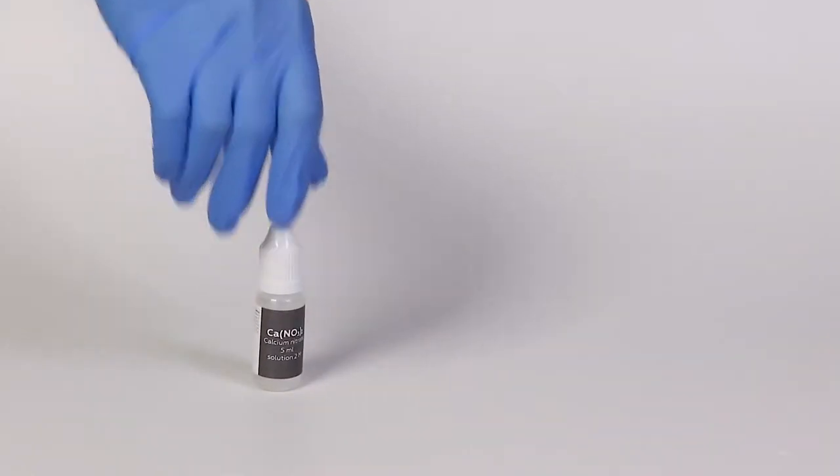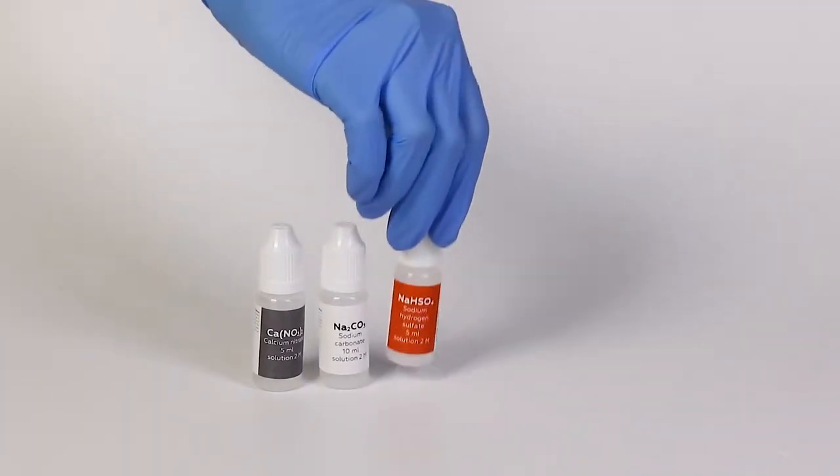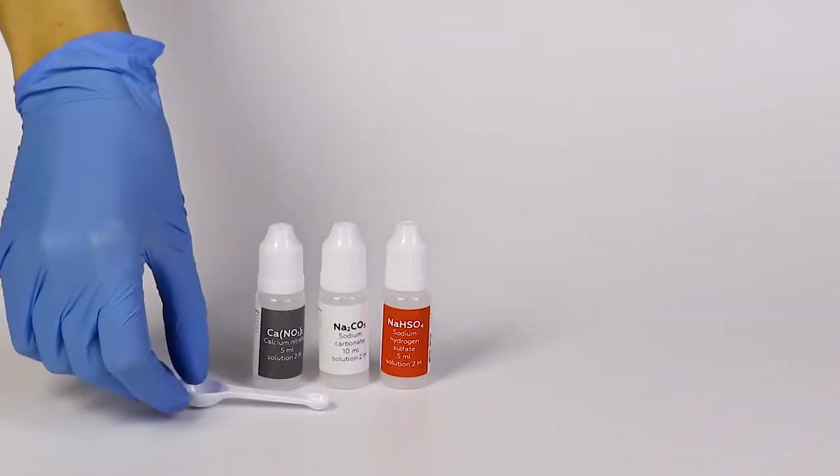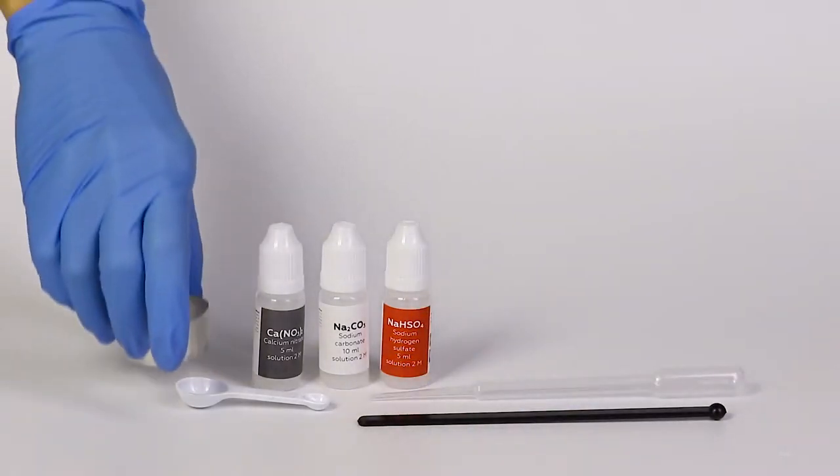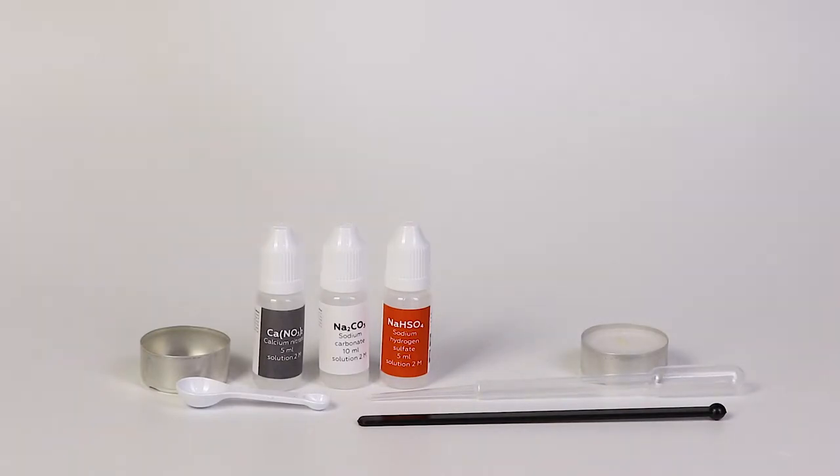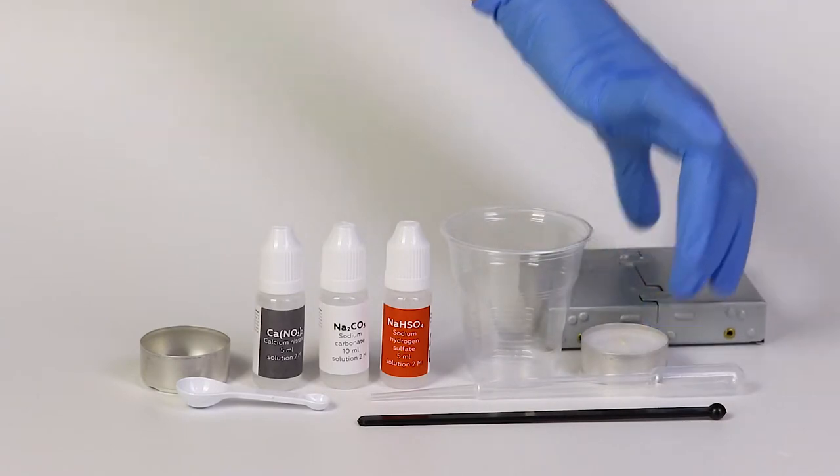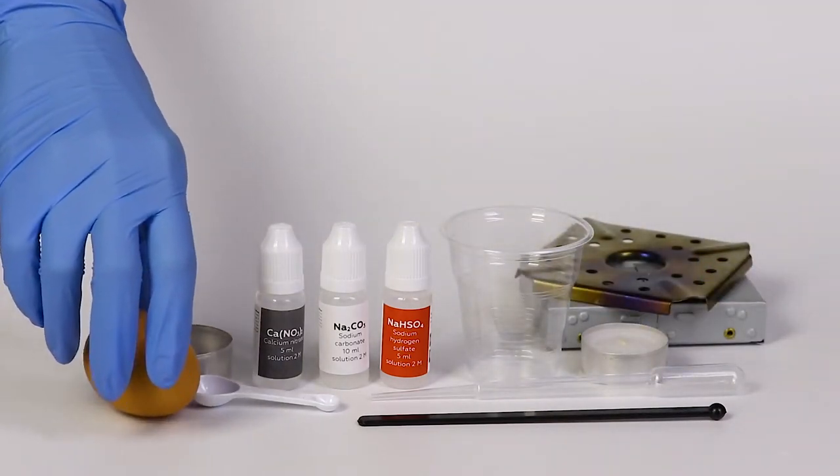For the yolk from white experiment, you will need three solutions: calcium nitrate, sodium carbonate, and sodium hydrogen sulfate. You will also need a measuring spoon, the Pasteur pipette, a plastic stirring rod, a mold, and a candle. From the starter kit, you will need a disposable cup, the solid fuel stove, and the flame diffuser. You will also need an egg and matches or a lighter.